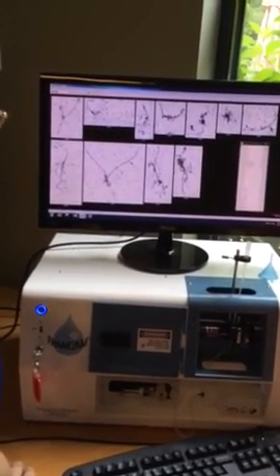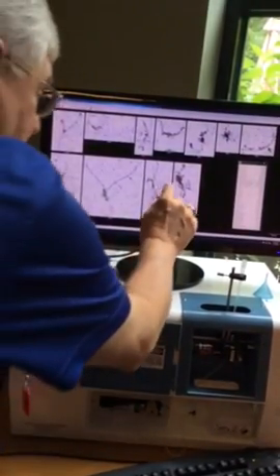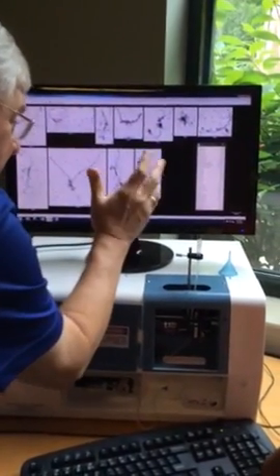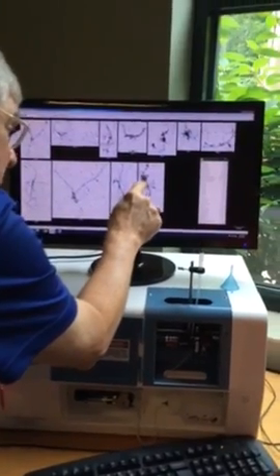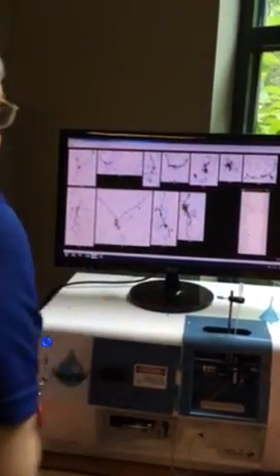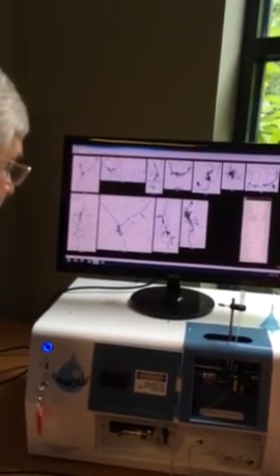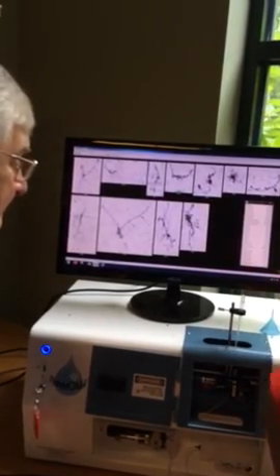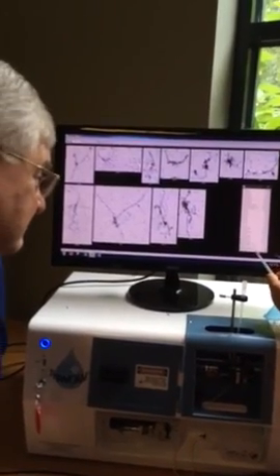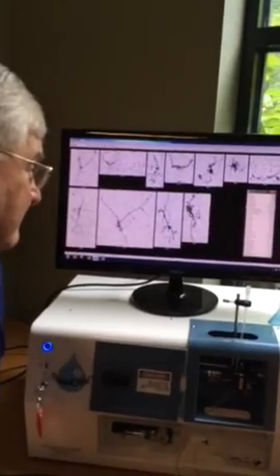So we have these, what are these filaments? That's what I'm seeing in there. I saw in the microscope these groupings here, which I looked into everything I could, and they looked like cyanobacteria, but I really don't know what they are. All of these are very similar. These filaments are huge. So the length of this guy, we need to bring length into the field of view here.